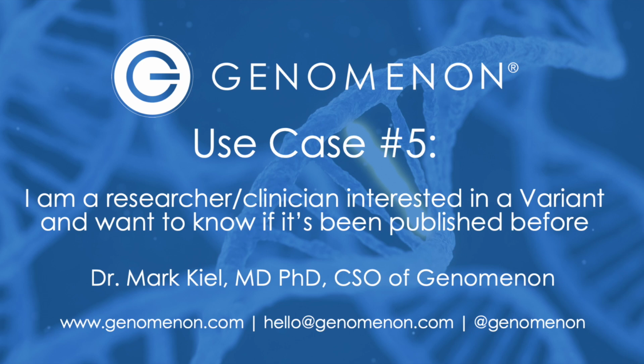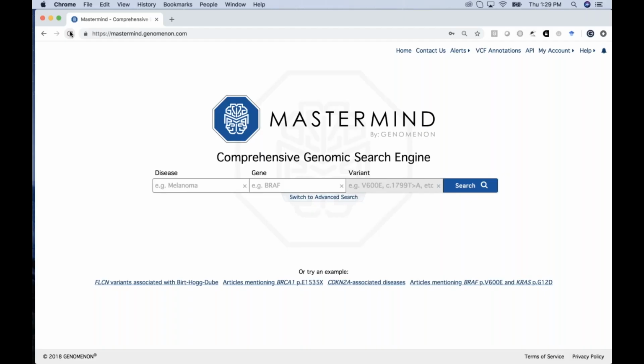I am a researcher or clinician interested in a variant and want to know if it's been published before and to understand about that publication landscape. This is by far the most frequent use case for our Mastermind users. There are many others that I described earlier and some more that I'll describe that are a little bit different than that, but this is the most frequent use case where previous to coming across Mastermind, users would either be searching through PubMed or Google Scholar.